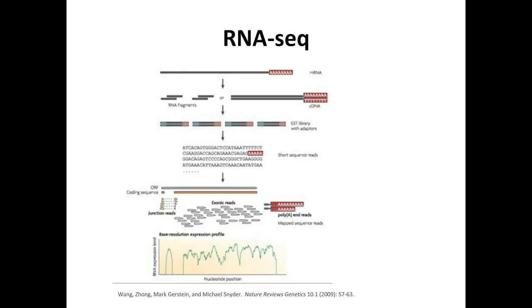We send them for sequencing, and after sequencing, people receive a large amount of data, small sequence reads, like this example. They will be 100 or 50 base pairs, depending on the protocol that you use.